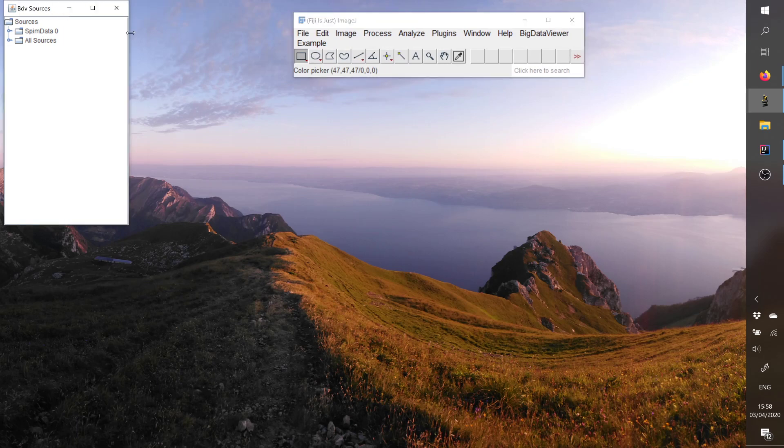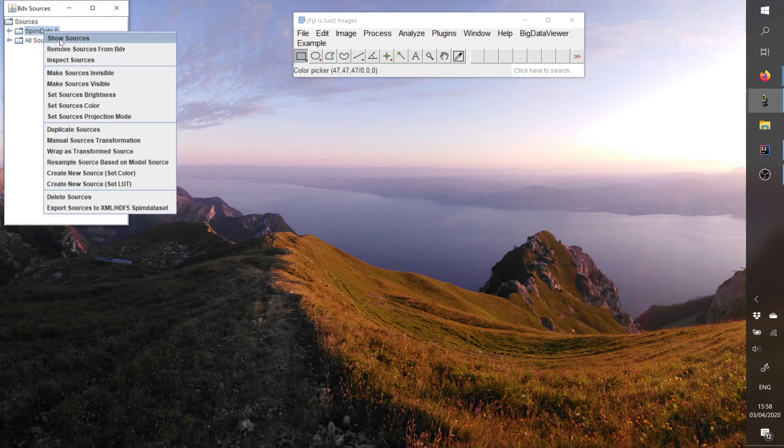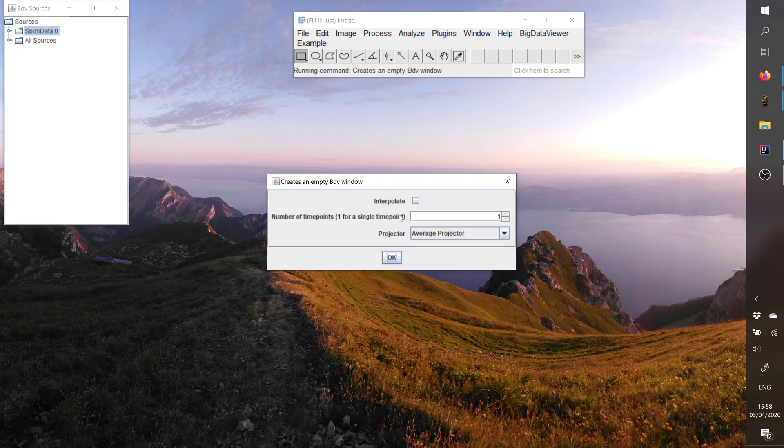So if I want to see what I've just loaded, I can right-click and do show sources. There are a few options that I will not discuss here.